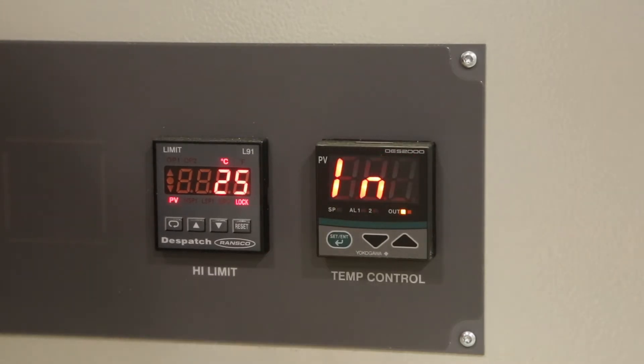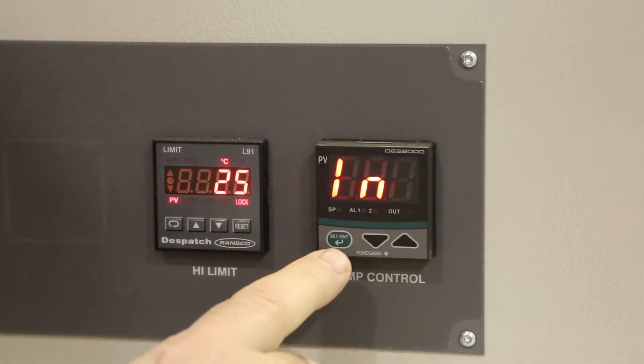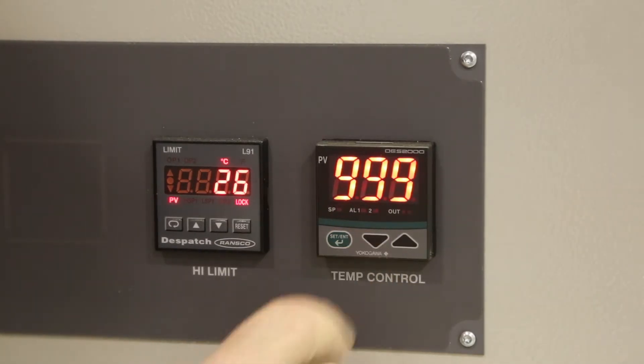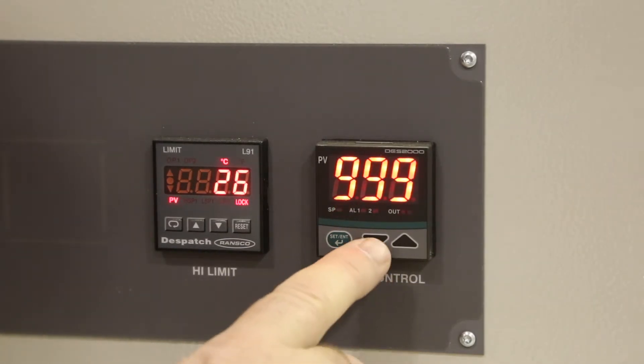Press the green button twice to get back to LN. Press the green button again to get to SPH for set point high limit. Press the down arrow until the display reads 400.